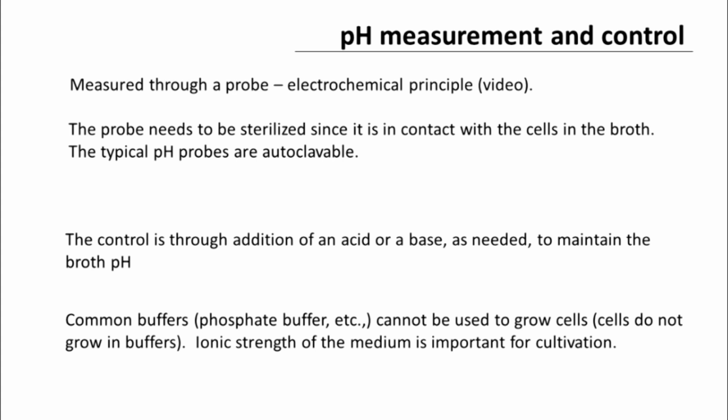In fact, we have done some work on that. We have tried growing cells in buffers. We didn't find literature, so we did not know whether it had been done. So we went ahead and grew cells in buffers, and to our surprise, we found that they don't grow in buffers at all.